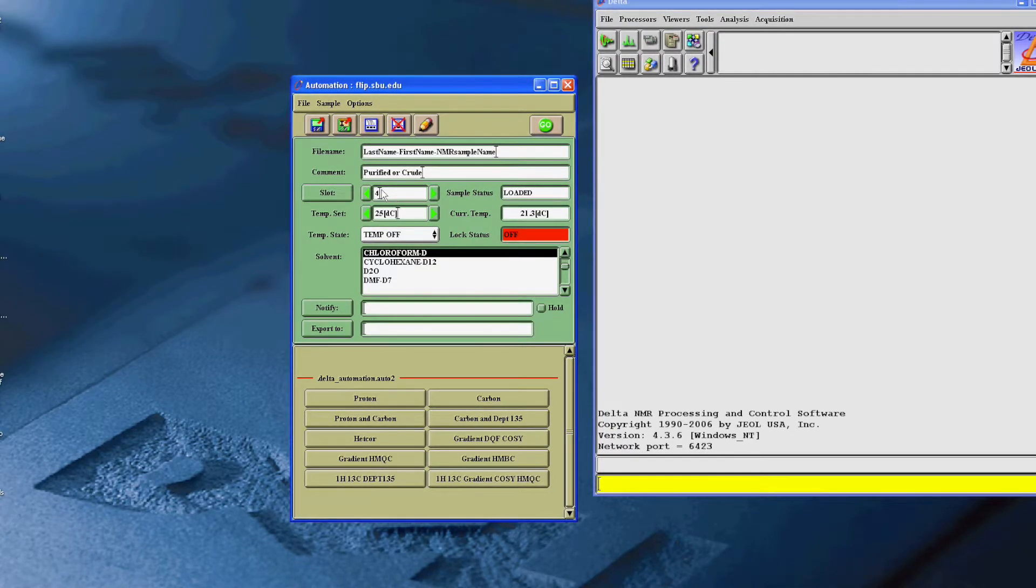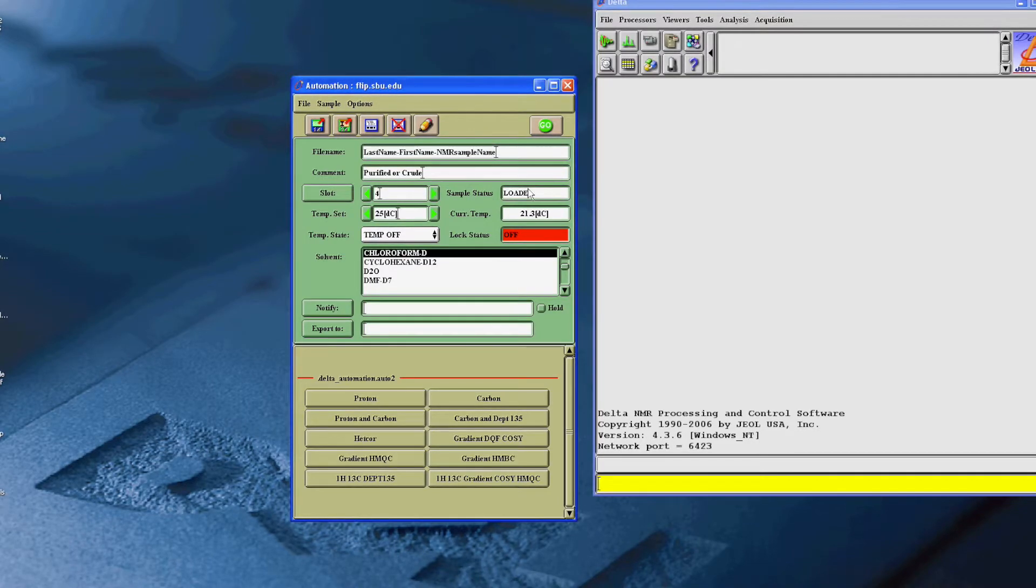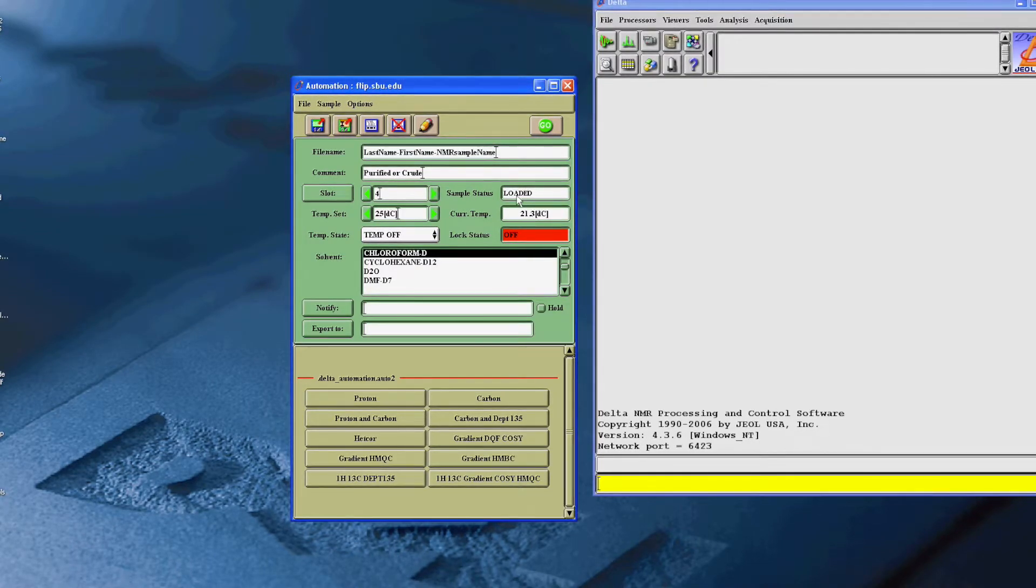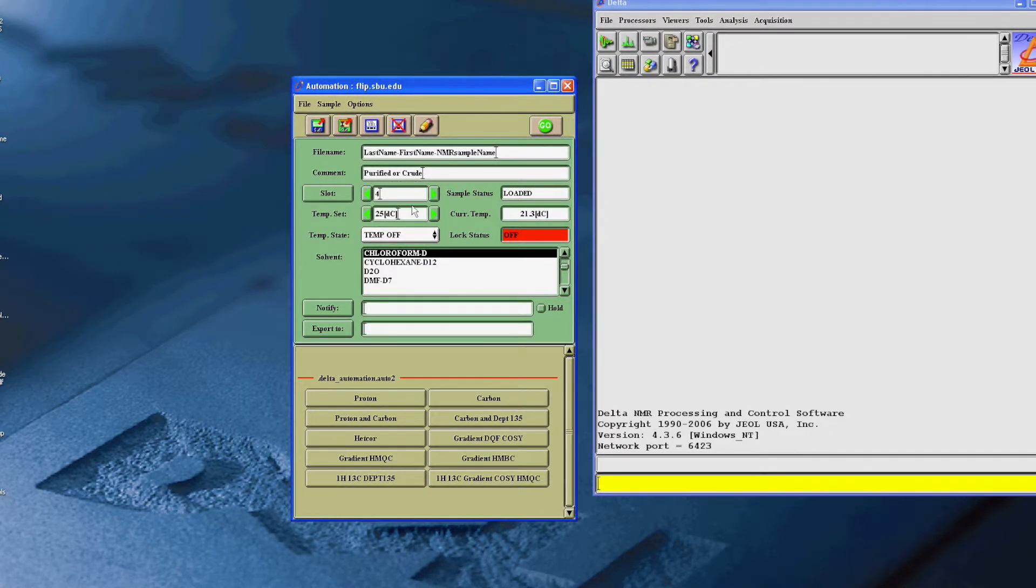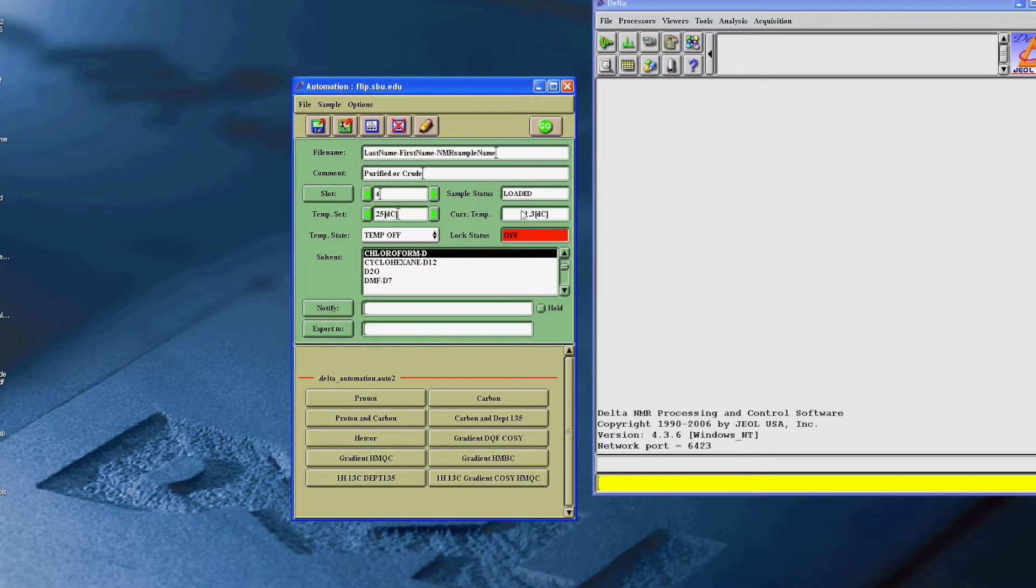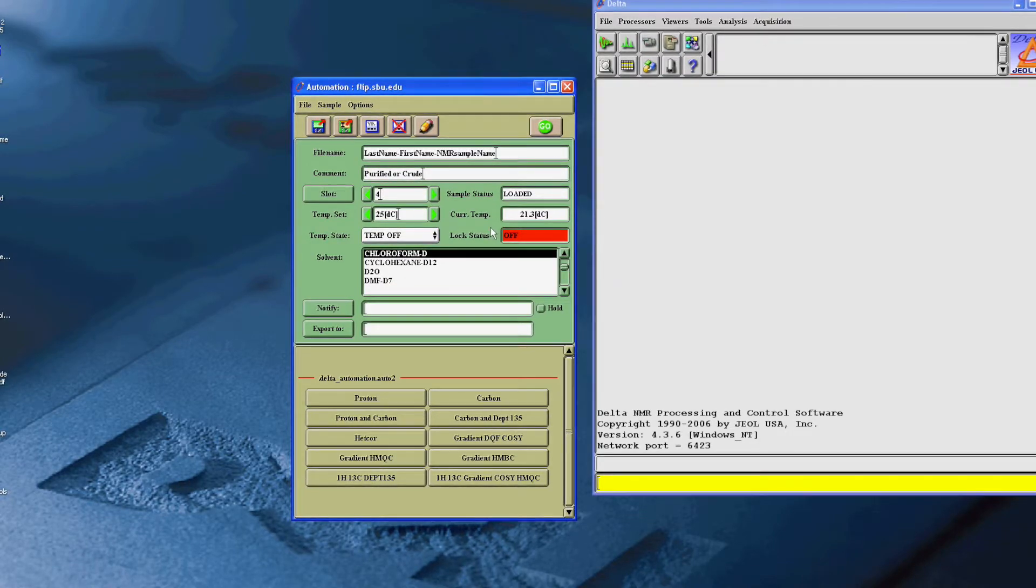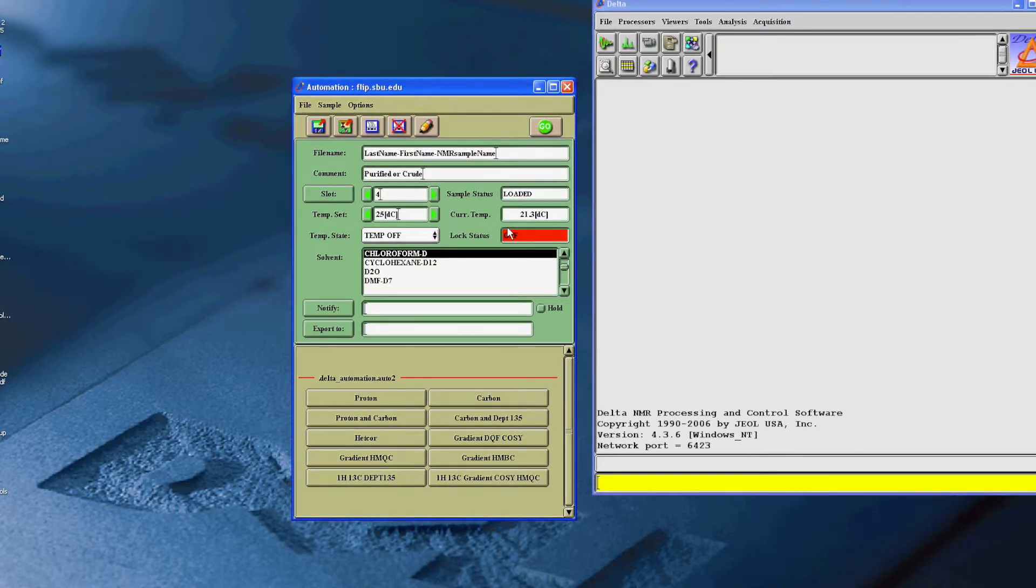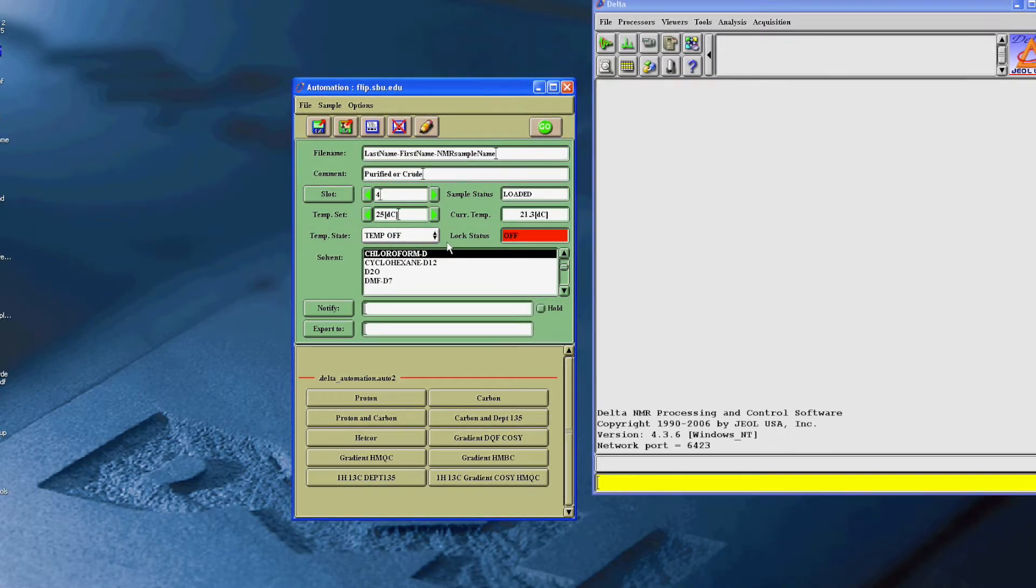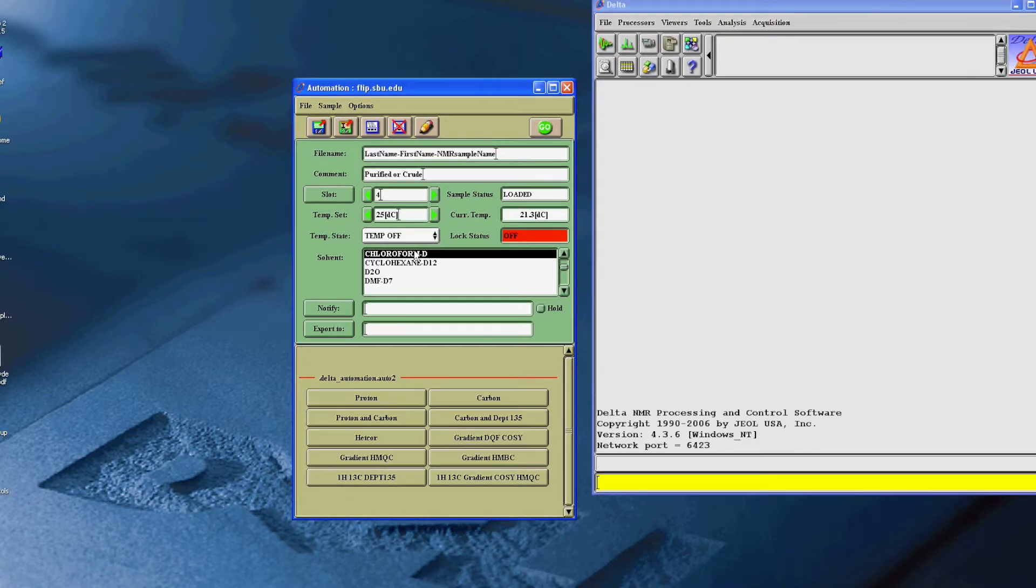Now, you'll want to confirm the slot number, and the temperature settings should never be changed. Then, make sure you've selected the appropriate solvent.